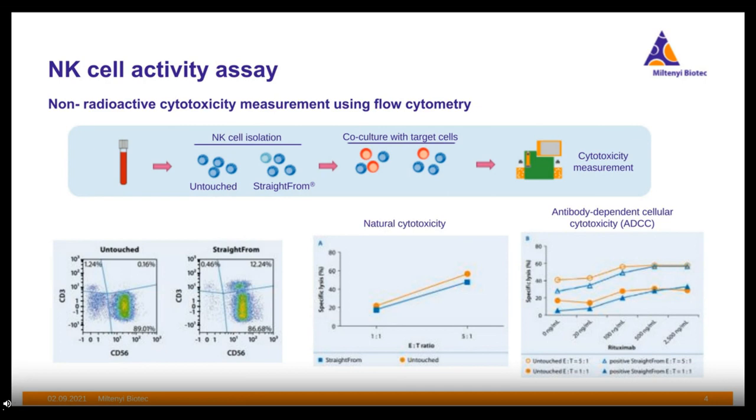So you can expect also, as I mentioned earlier, you can use flow cytometry to directly measure this cytotoxicity at a single cell level. So this basically highlights this feature in such an NK cell activity measurement assay.